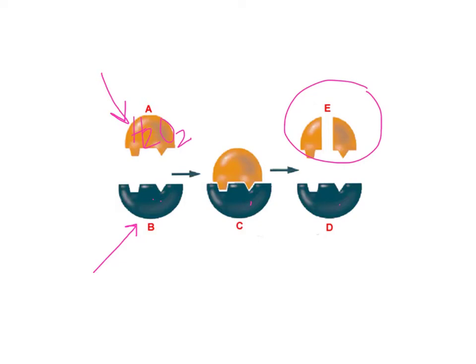For our lab, we're going to be adding the hydrogen peroxide onto the cells to see the amount of catalase present. So B, our enzyme, is catalase. Oftentimes, enzymes end in ASE, and that's helpful in being able to recognize what is the substrate and what is the enzyme. Catalase, once again, breaks hydrogen peroxide down into less harmful byproducts.